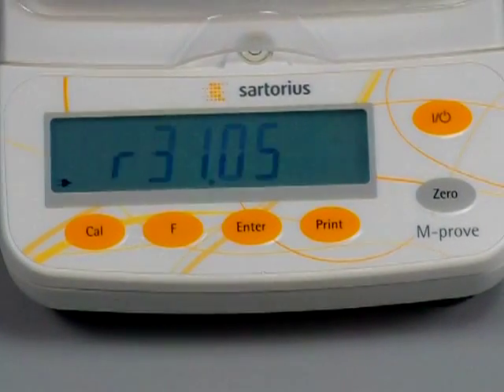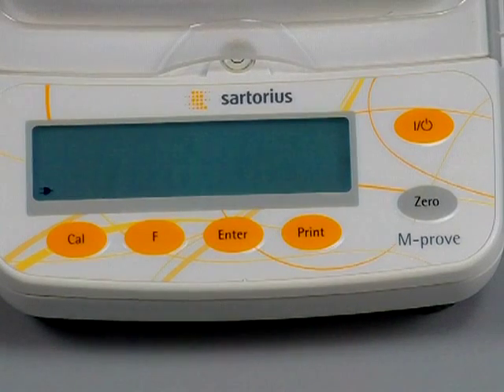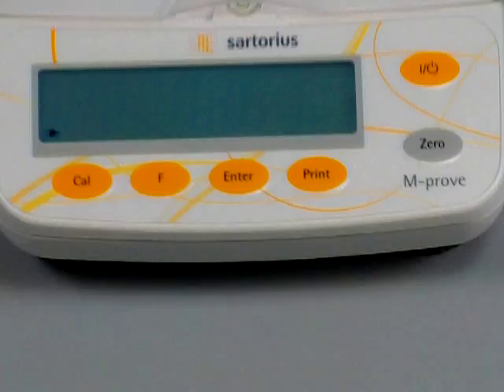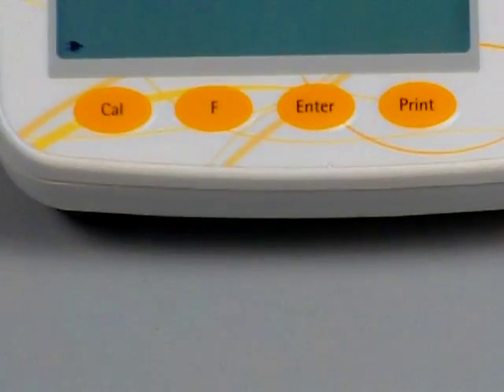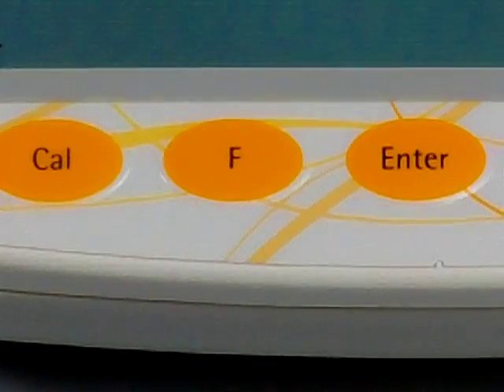You can see they have an LCD display with backlight, and you have the ability to calibrate the scale by just pressing the cal button, and you can change the weigh modes. Now with Sartorius, you can only toggle between two weigh modes.